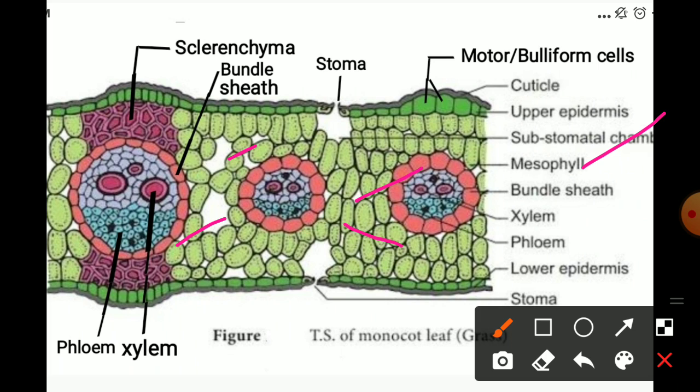There are intercellular spaces just like the sponge, where the intercellular spaces are numerous. Over here, this spongy mesophyll photosynthetic tissue shows the porous nature, loose arrangement of the green photosynthetic chlorophyll-containing chlorenchyma cells. We call it a mesophyll type of tissue.